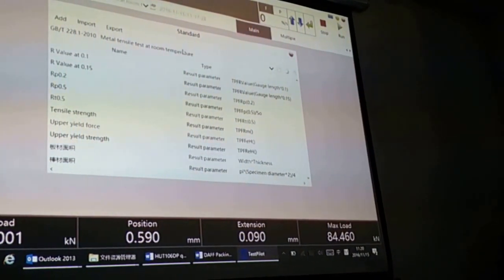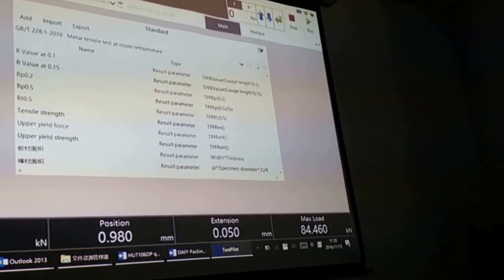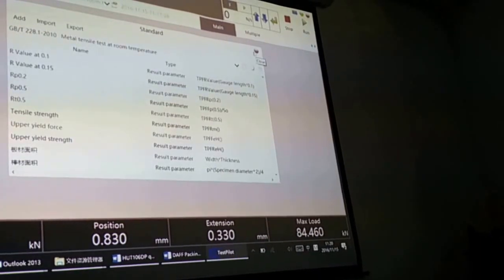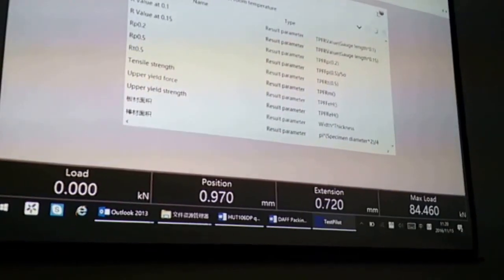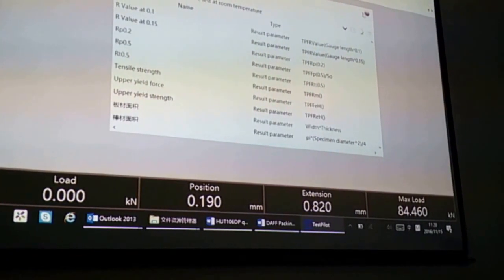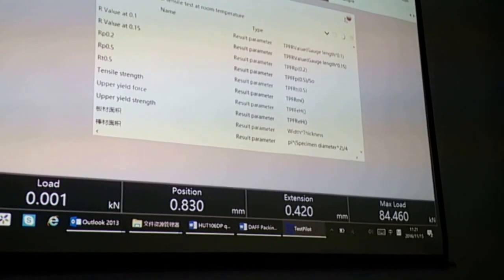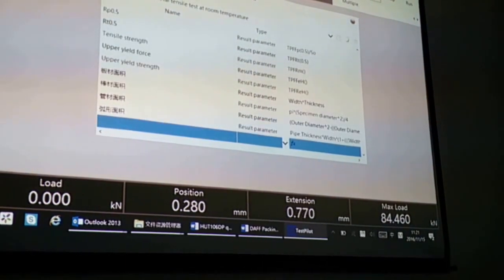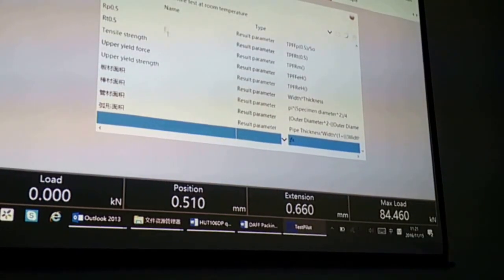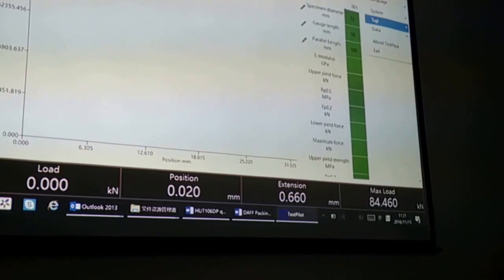Sometimes you have a very special standard. Your customer may have a very special standard. It's very useful for companies who produce weapons and the like. They have closed standards, I mean, standards which are not for public use. So your customer can add his own parameters, so he can manage.